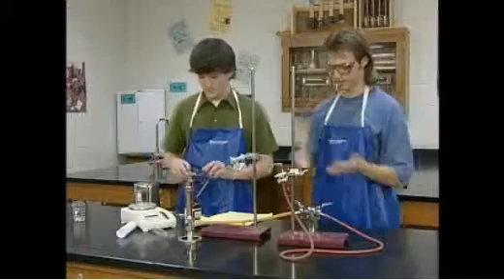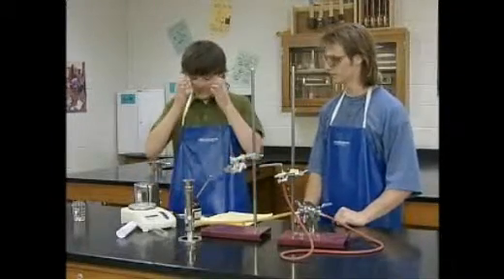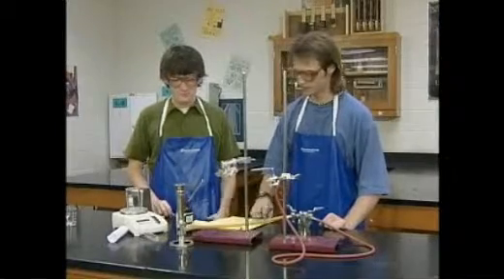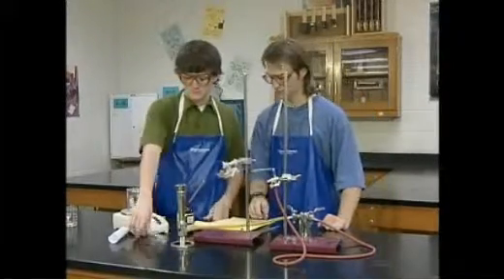Sometimes, empirical formulas seem kind of tricky, but once you get some practice, you'll see that it's just an application of stuff you already know. Let's do another experiment and use it to practice writing an empirical formula. The students are going to convert a copper oxide compound into pure copper by allowing it to react with methane gas. They will be able to use their data to calculate the empirical formula of the compound.